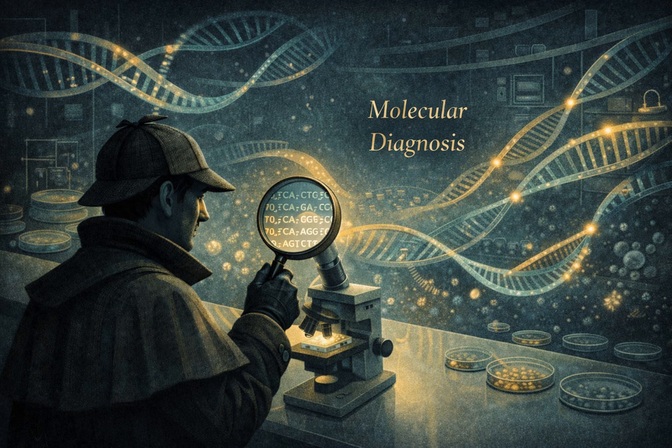Yes. And that dramatically increases both sensitivity and specificity. Because think about it. If the first set of primers accidentally bound to some random non-target DNA and amplified it, the chance that the second, internal set of primers will also find a match on that random piece is astronomically small. It weeds out the false positives.